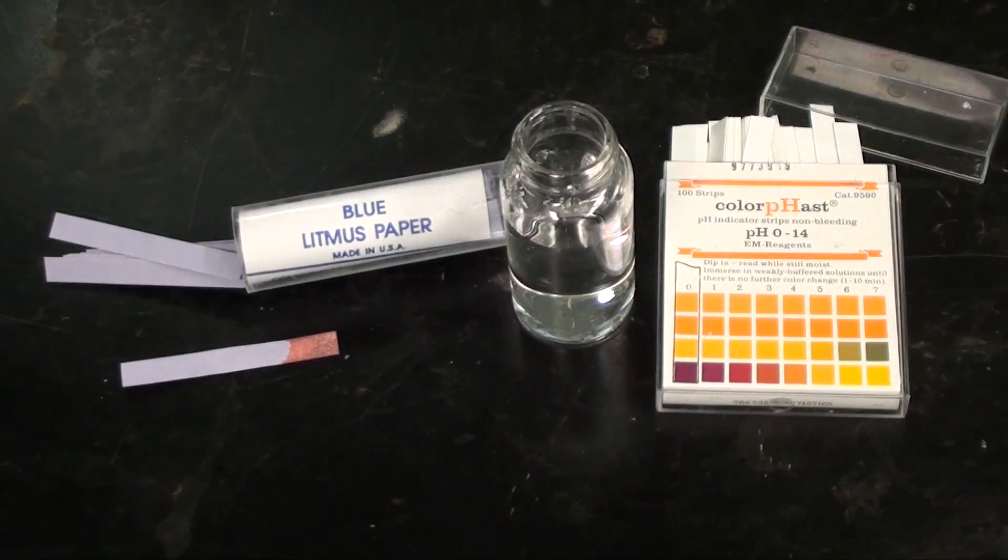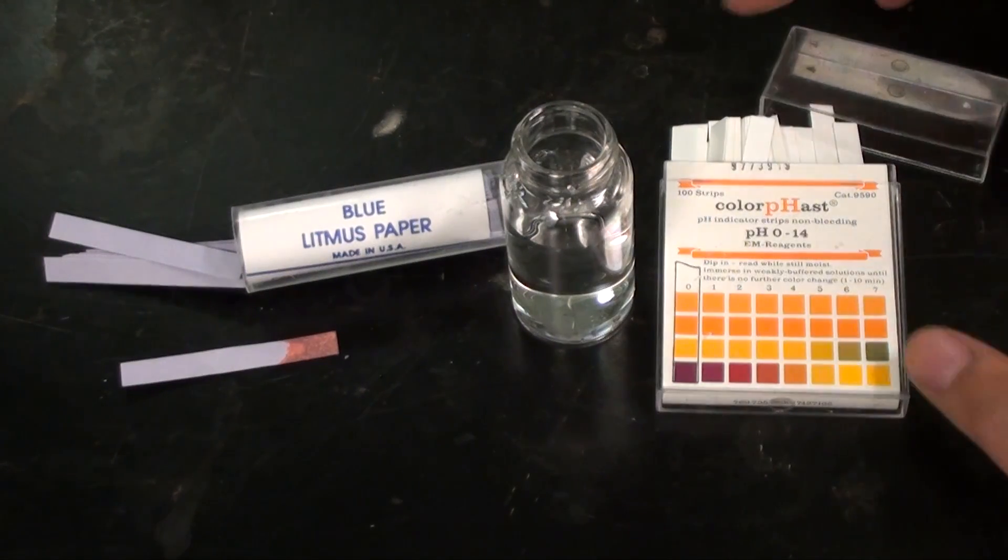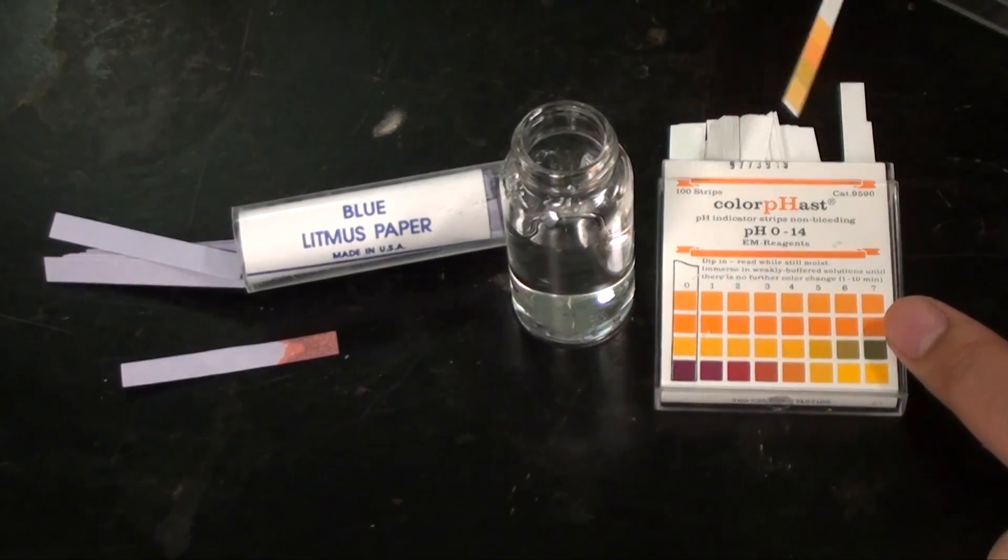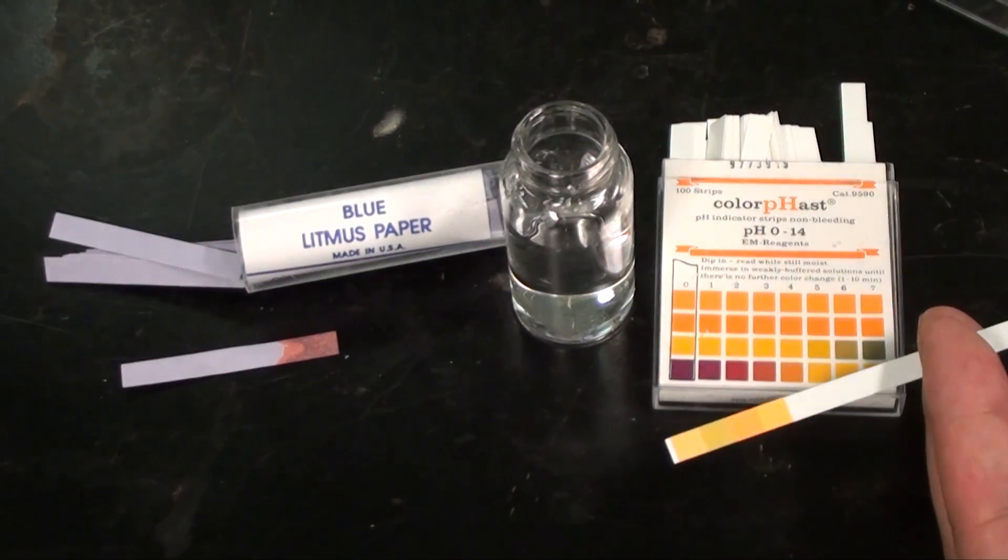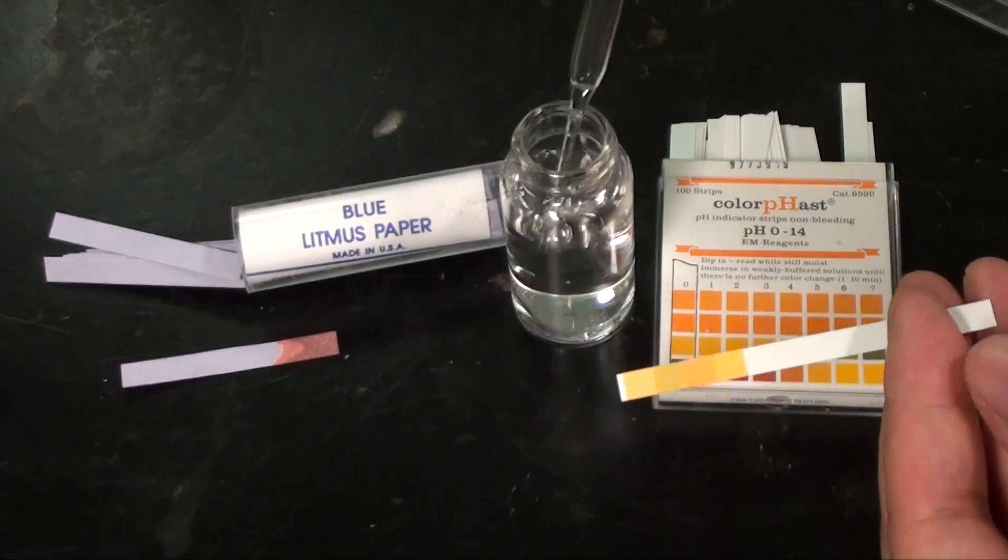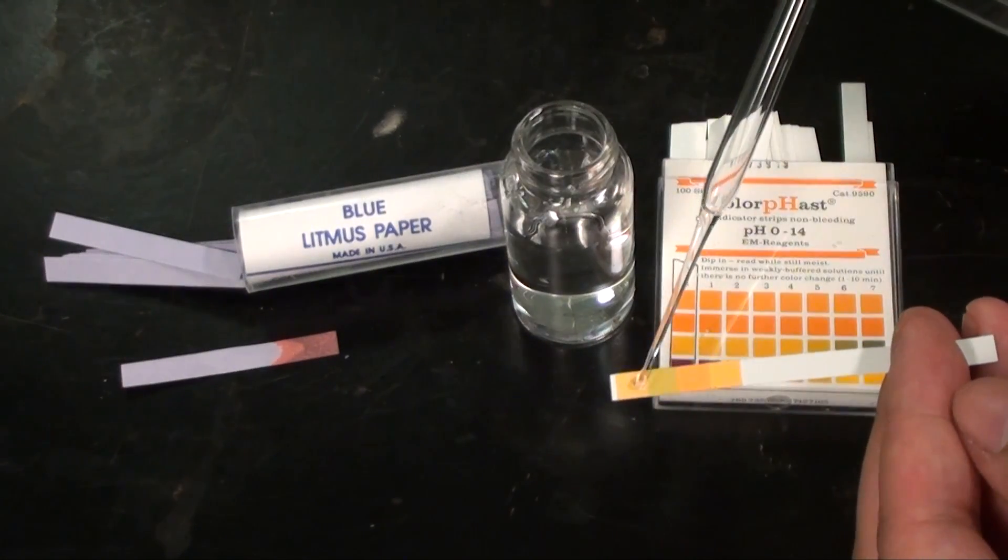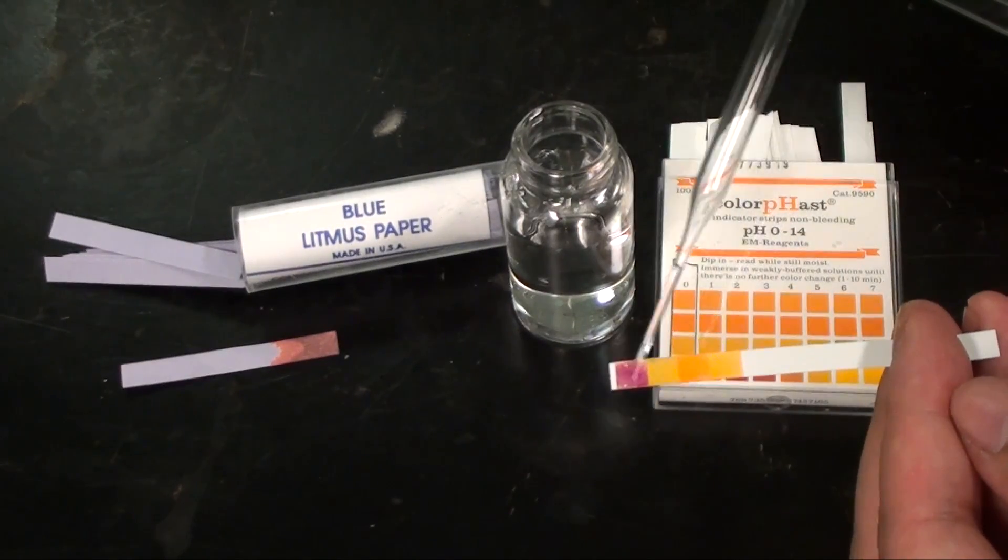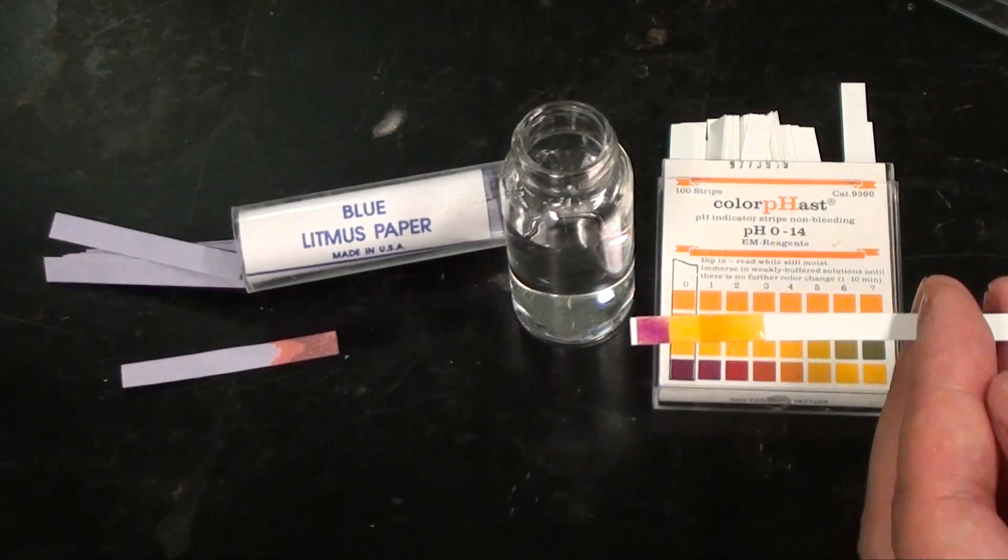Litmus paper is good for simple acidic or basic measurements, but for more precise determination we have this more advanced pH paper on the right. It consists of multiple strips of pH indicators that have different transition points. Just apply a small drop of the solution you want to measure to the strip. Dipping the strip is actually not the best way to use pH paper because you might contaminate your sample with the indicators used on the paper.